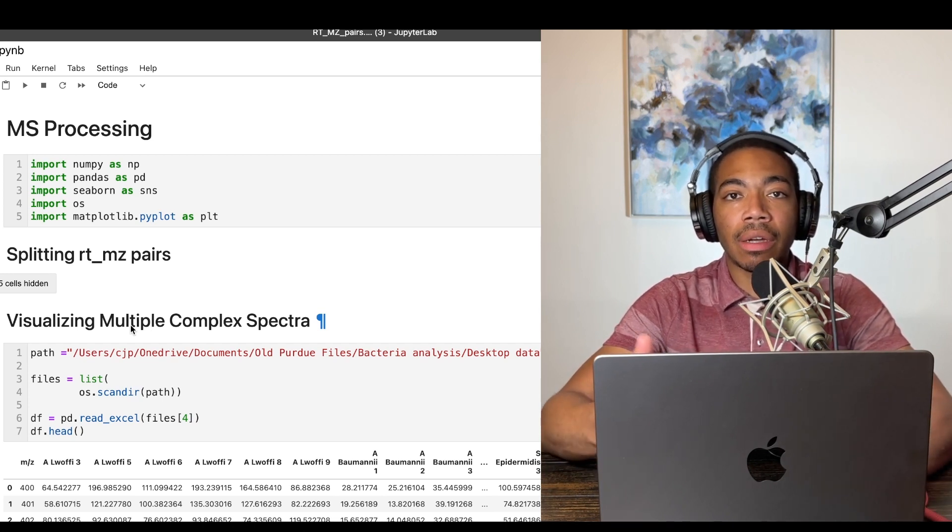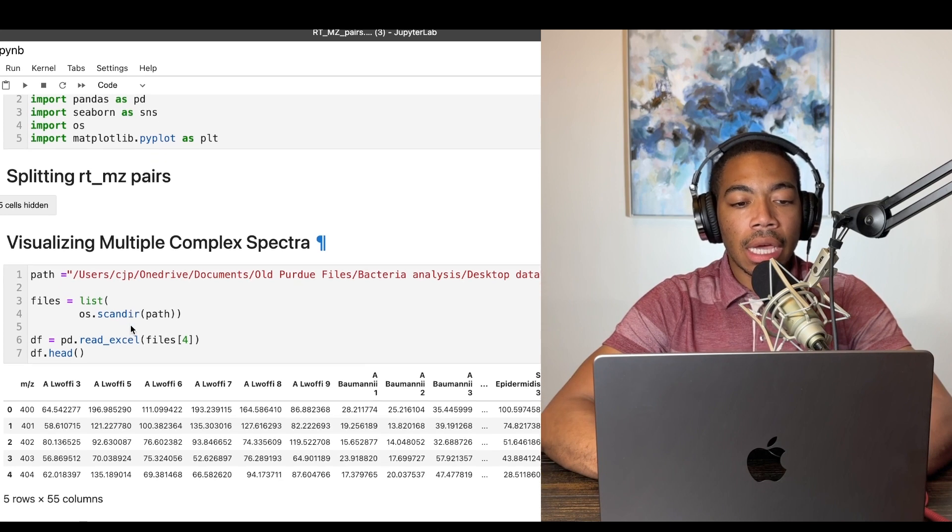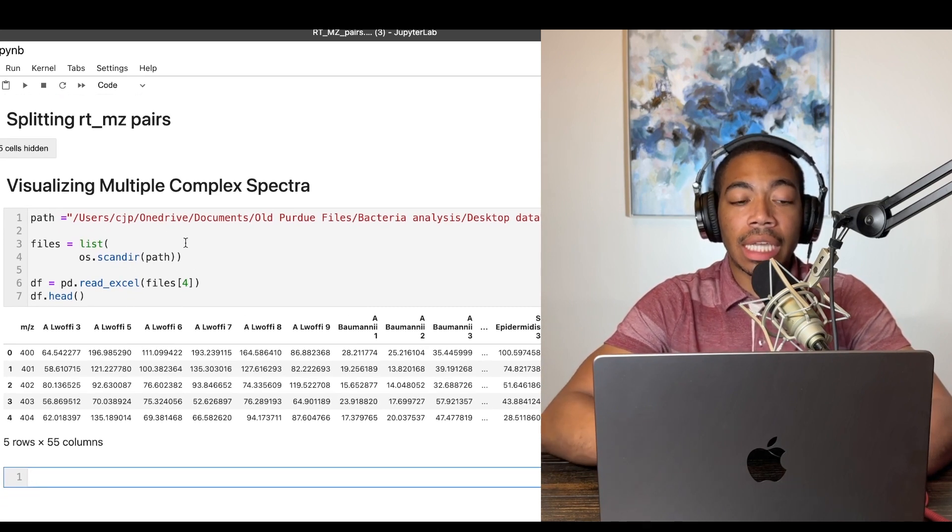So this could be Raman spectra, IR, mass spec, NMR. There are a number of ways and the way I want to demonstrate is a heat map.